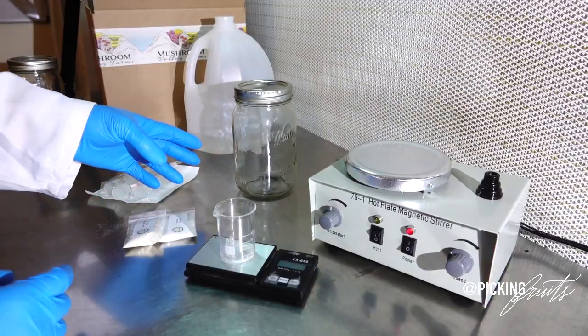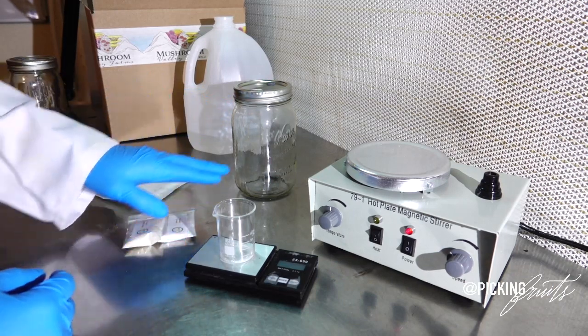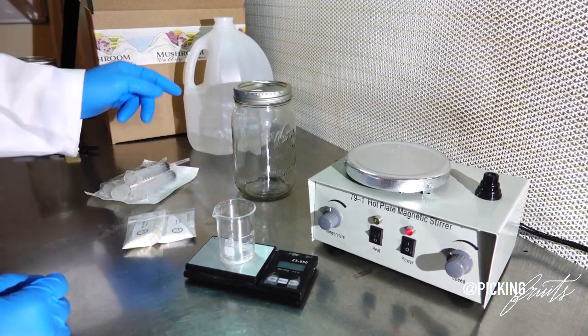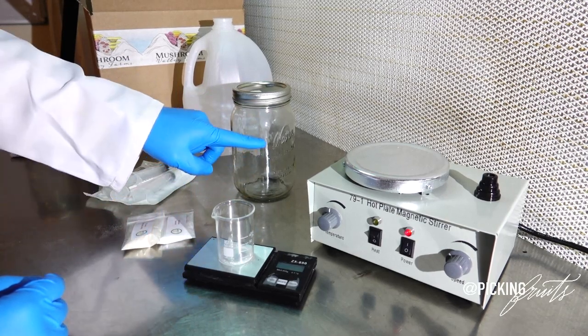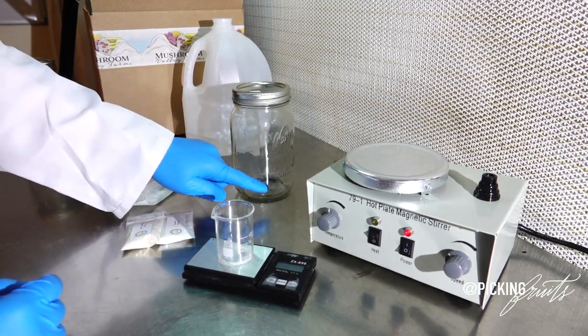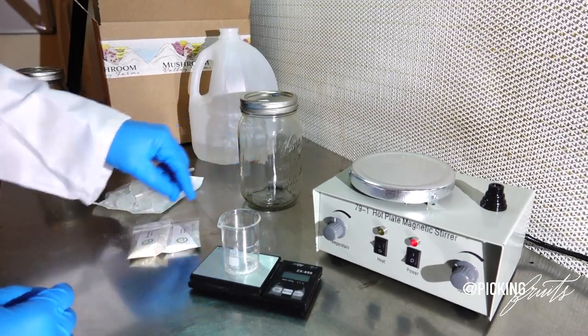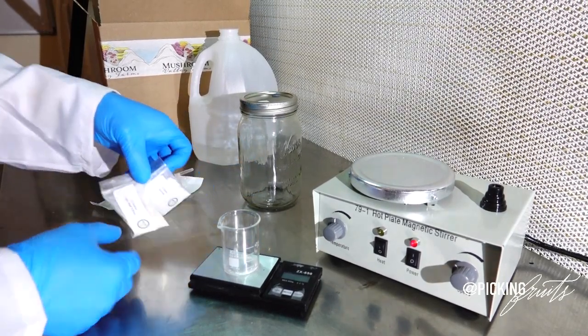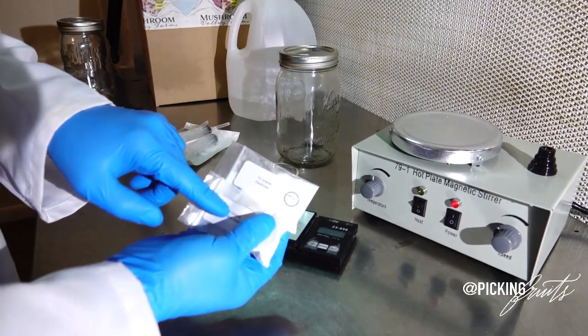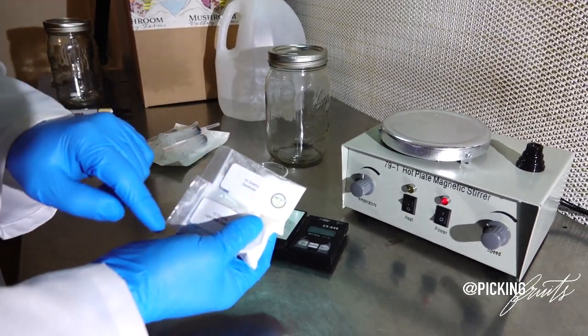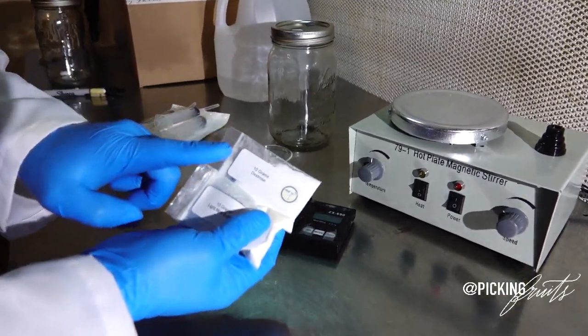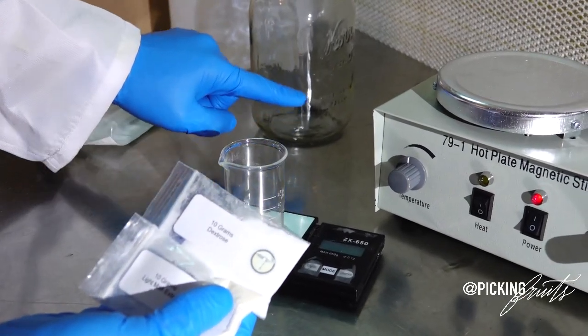Okay, so the first step to making our liquid culture is going to be determining how much liquid media we're actually trying to create. For this instance, we're going to be making 500 milliliters of liquid culture. So to do that, we're going to start off with 500 milliliters of distilled water. And we're also going to be starting off with 5 grams of a 50-50 mix. We're going to use a single gram for every single 100 milliliters of water.